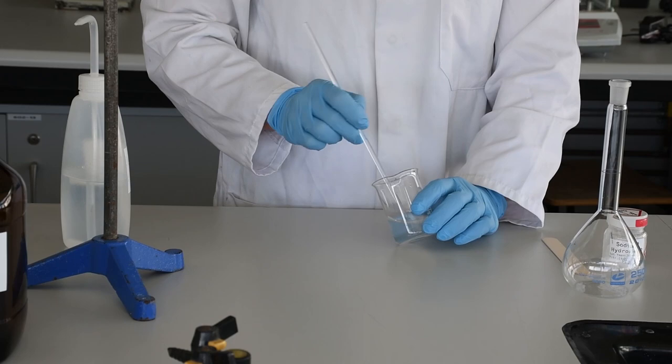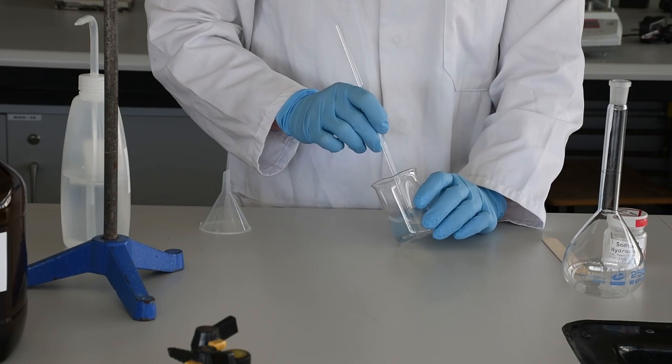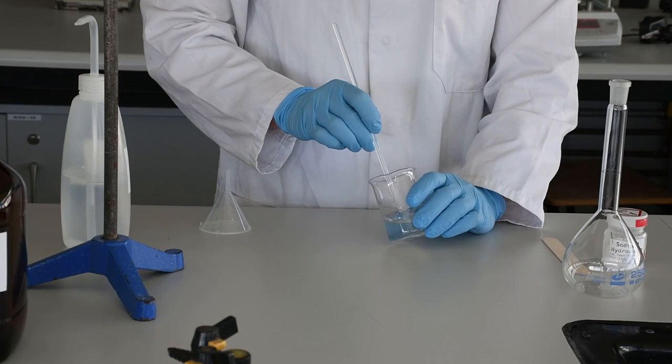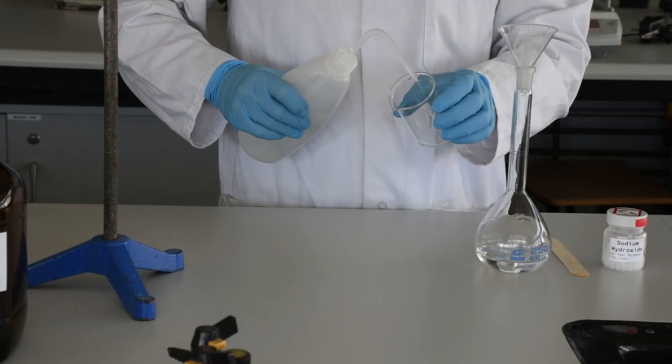When it does, we're going to take our funnel and use that to transfer the liquid into the volumetric flask. Since we're making up an unknown concentration, it doesn't really matter whether we transfer everything, but it's good practice to quantitatively transfer it. We wash off the glass rod and then very carefully wash out the beaker three to four times to make sure all of the material has been transferred across.